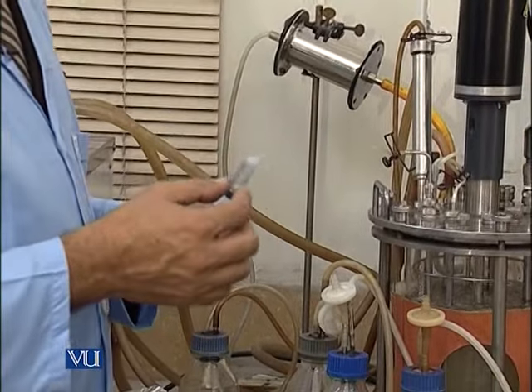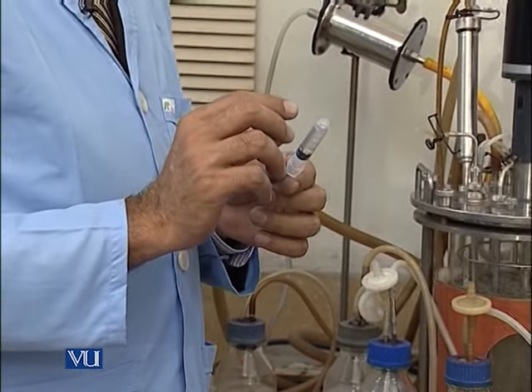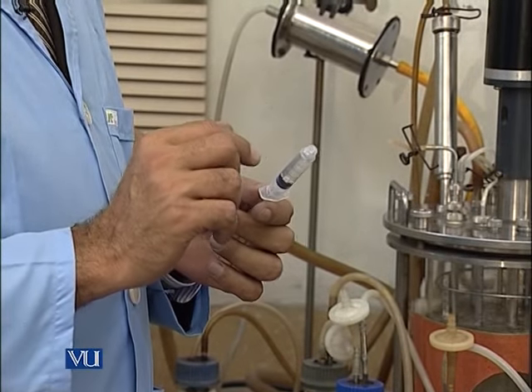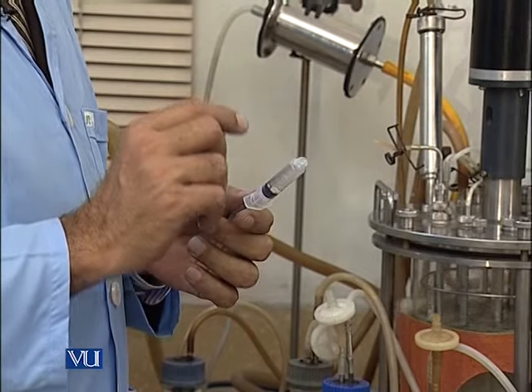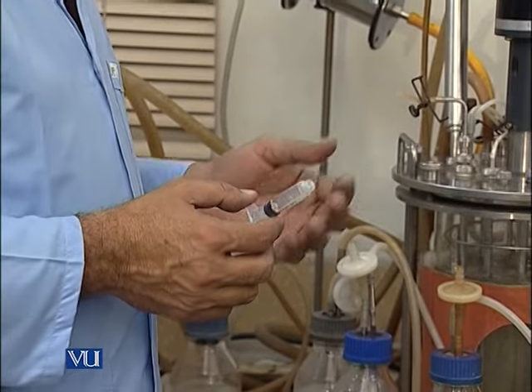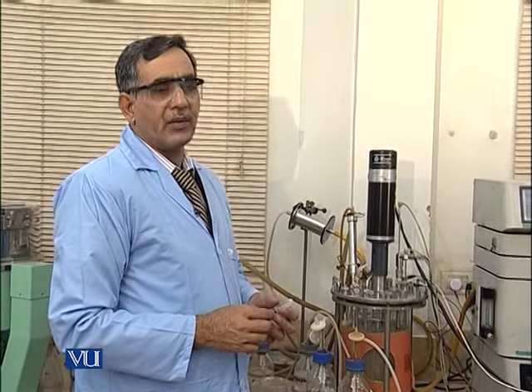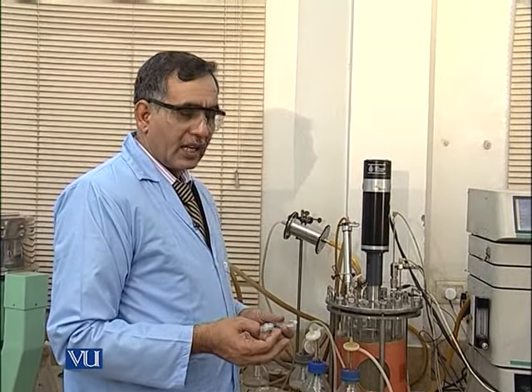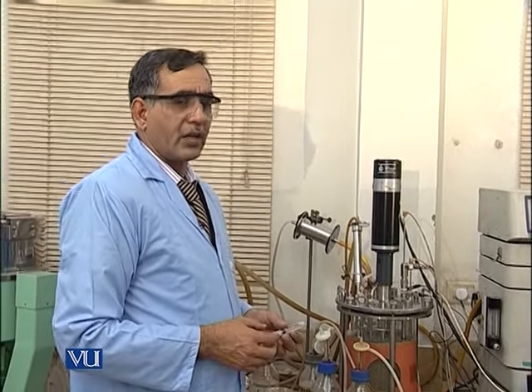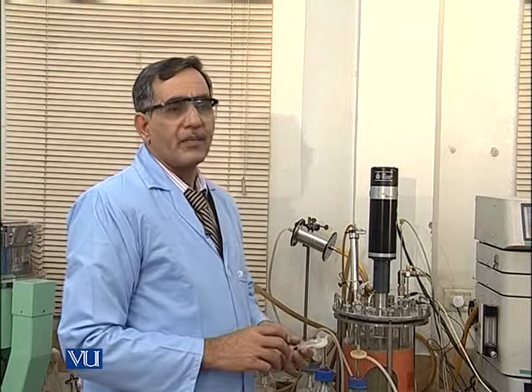On each time when we take out the sample, we will calculate the biomass produced and the carbon source starch utilized, and then the product which we call amylase production and the protein formed. At each step of the sampling, which we will take after a 4 hour interval, we will check biomass production, substrate utilization and product formation, in order to calculate the exact kinetics of this fermenter.